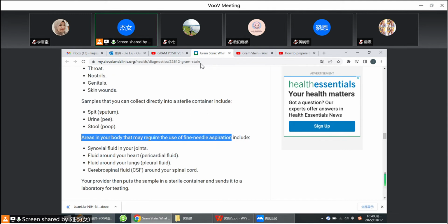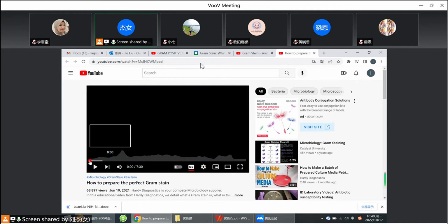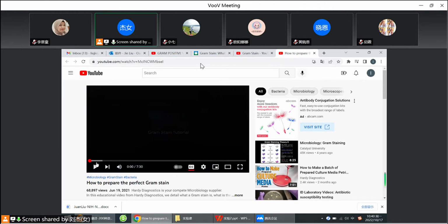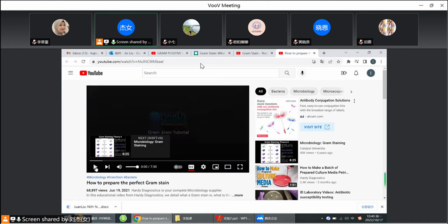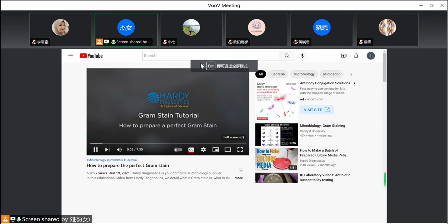So when we get the sample, then how to do the Gram staining? Here it will show this video. It shows the Gram stain method very well. Now let's watch the video.